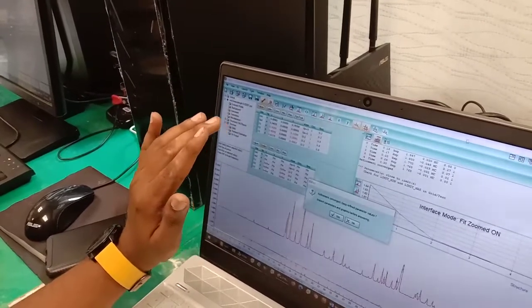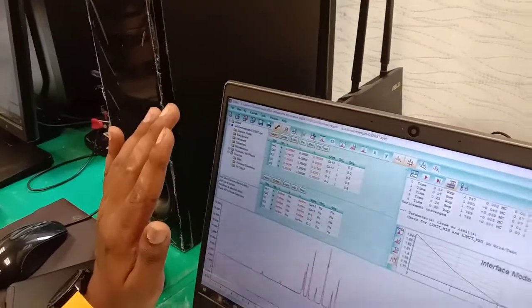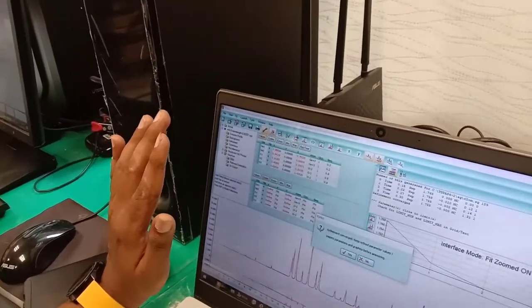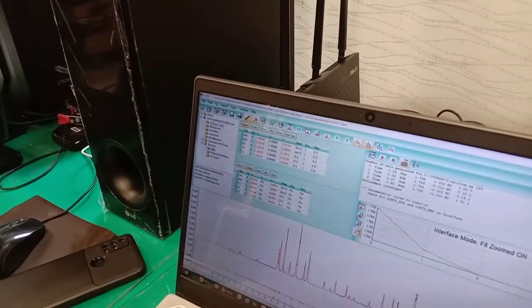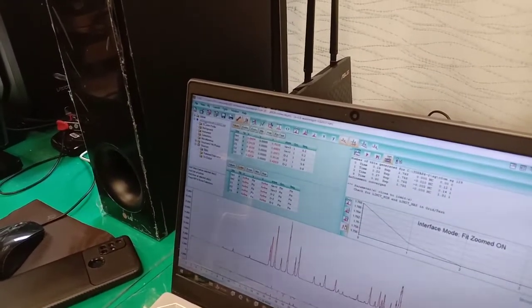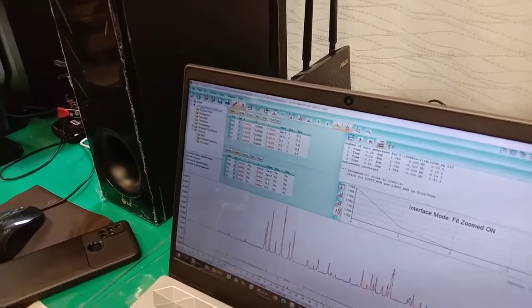It is decreasing. Yes. And now I also open this site, gallium. Before that you have to open every atom and you have to refine it. Okay, it's 0.755. So basically in this case he said x is equal to 0.6. Yes.